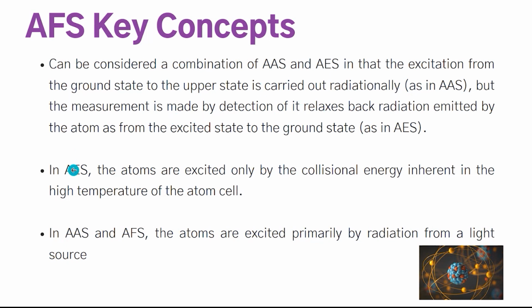In AES, the atoms are excited only by collisional energy inherent in the high temperature of the atom cell, while in the AAS and AFS methods, the atoms are excited primarily by radiation from a light source.